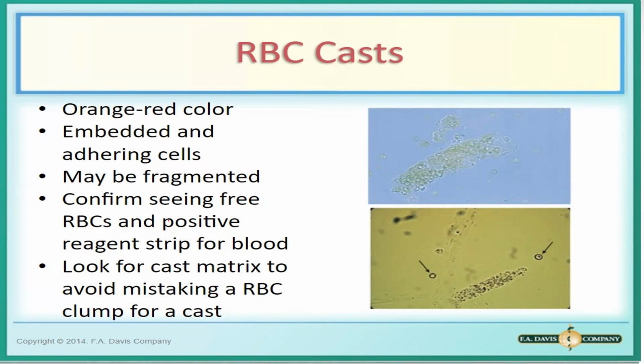Okay. Physiologic cause natin again, strenuous activities, makikita mo ulit si RBC cast. Why? Kasi kapag meron kang strenuous exercise, diba, it triggers the release of RBC and then increase din the hyaline cast. So therefore, possible RBC cast because of strenuous exercise din. Okay. So if there is bleeding within your nephrons, RBC casts are more specific than free RBCs in urine. Why? Kasi nanggaling siya sa tubules. Okay? So kapag po may RBC cast ka, it signifies yung damage is within the tubules and not after.